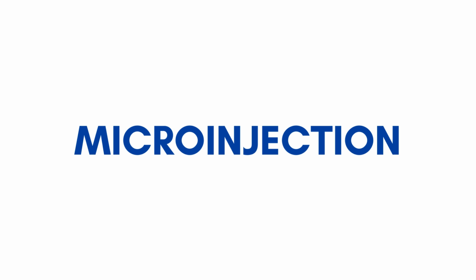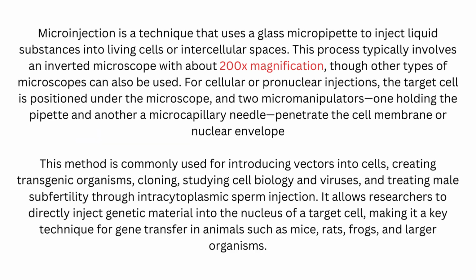Microinjection. Microinjection is a technique that uses a glass micropipette to inject liquid substances into living cells or intercellular spaces. This process typically involves an inverted microscope with about 200x magnification, though other types of microscopes can also be used.